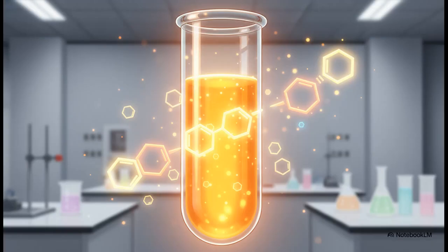Now, Step 2. This is where the magic really happens. Those newly formed furan derivatives condense with phenol under these highly acidic conditions. It's an electrophilic aromatic substitution which creates a phenylfuryl conjugated system, or, to put it in plain English for our eyeballs, it produces that brilliant, stable, orange-yellow color. That specific color is the key to unlocking your quantification.